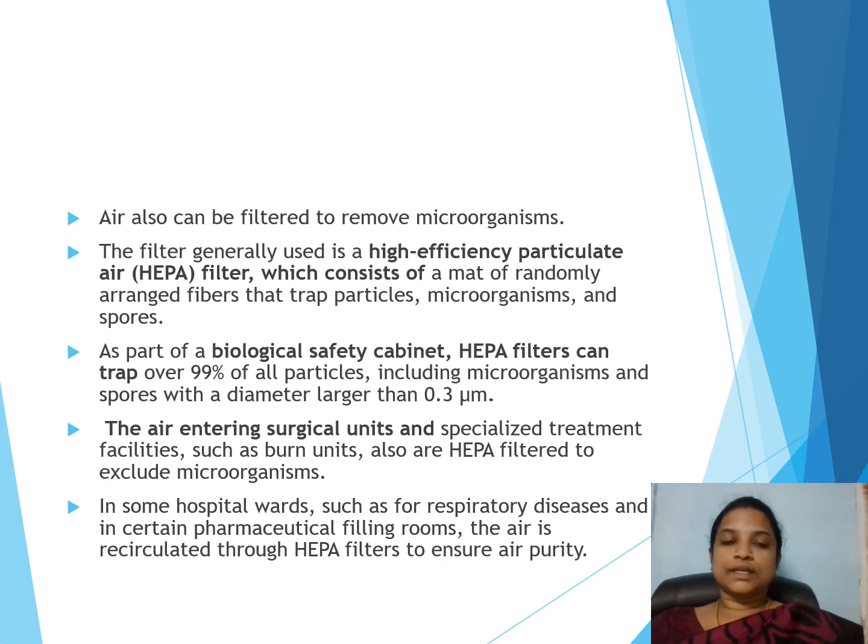The previous method is a technique by which liquids are sterilized by the use of filters, but air can also be filtered to remove microorganisms by the use of high efficiency particulate air filters, in short called HEPA filters, which consist of a mat of randomly arranged fibers that trap particles, microorganisms and spores. As a part of a biological safety cabinet, HEPA filters can trap over 99% of all particles, including microorganisms and spores, with a diameter larger than 0.3 micrometer.